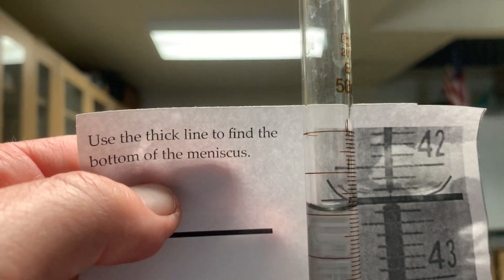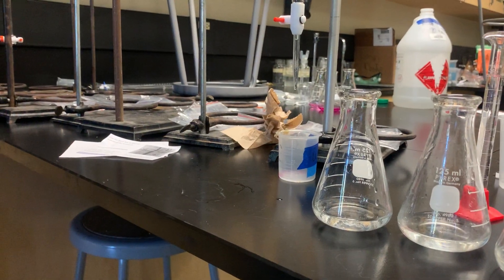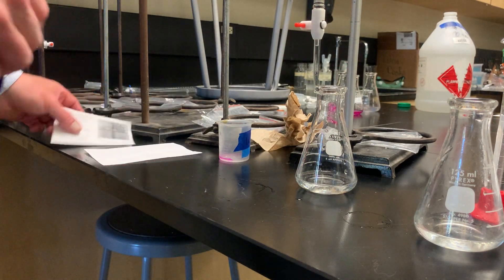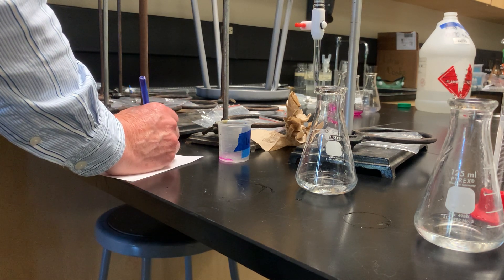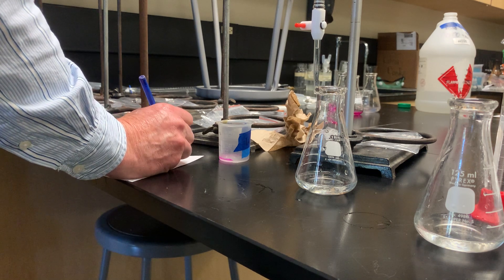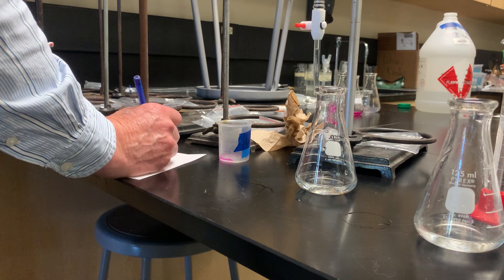Our starting spot — let me focus — looks like 1.95 or maybe 1.9. It's always a little tricky to read. So I'm going to write that down. For trial one, we're going to start at 1.95 milliliters. That's our initial volume.